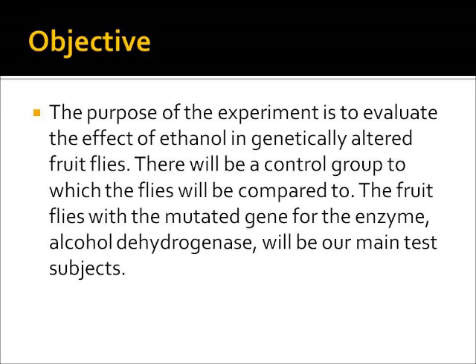So in this lab, we'll be using fruit flies, and the reason is that fruit flies have been used as a model organism in genetics for about 100 years. They have a short life cycle and are easy to maintain in the laboratory, and the genetics is very well understood. The DNA sequence for the Drosophila genome was published in 2000. Drosophila has only 4 pairs of chromosomes, and the genome contains 180 MB of DNA and about 14,000 genes.